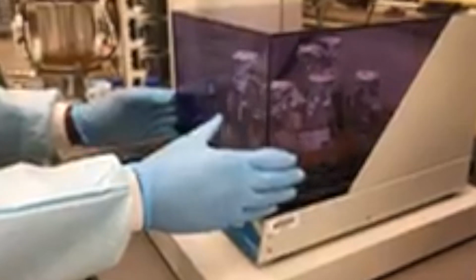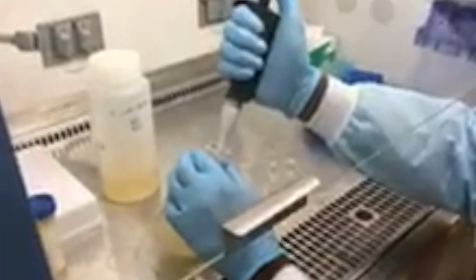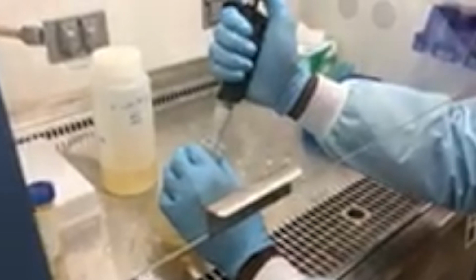Collect the optical density readings for the bioreactor and benchtop shaker flask every 30 minutes. The video shown illustrates how a reading is taken for the benchtop shaker. If the readings on the spectrophotometer go above 1, dilute the next sample taken with fresh media. Be sure to note the dilution. Once the measurements have stabilized for an hour, the experiment has completed and the results can be compiled.